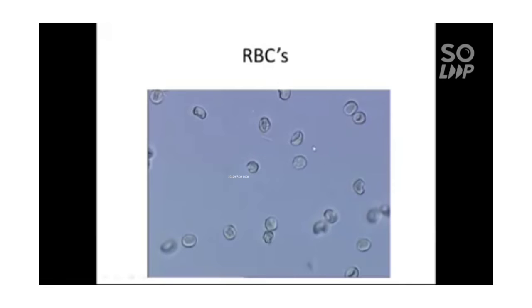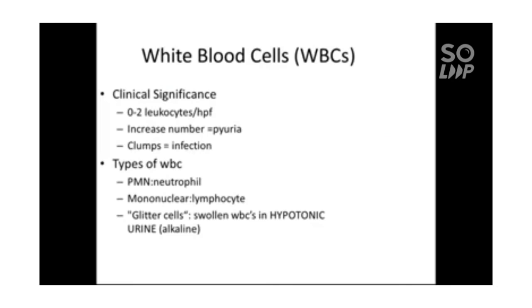Here's another picture of red blood cells. Note the concaveness of the cell and the shape. And red blood cells can have various different shapes, but we oftentimes look for that concave shape.